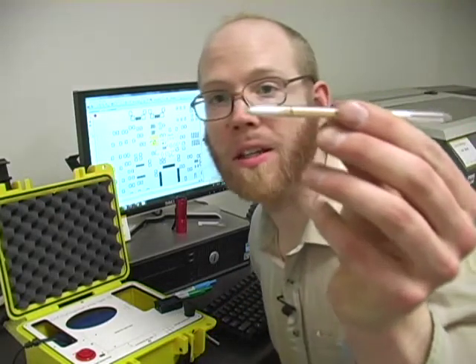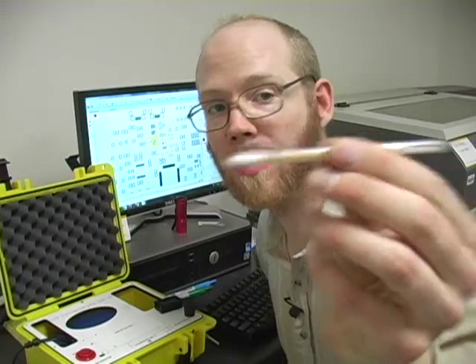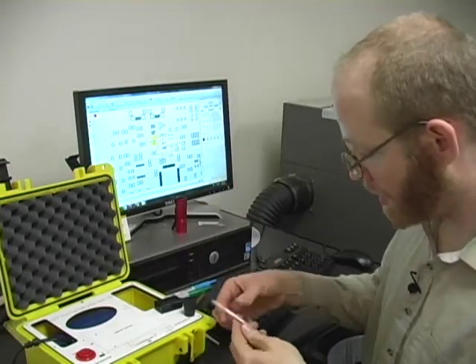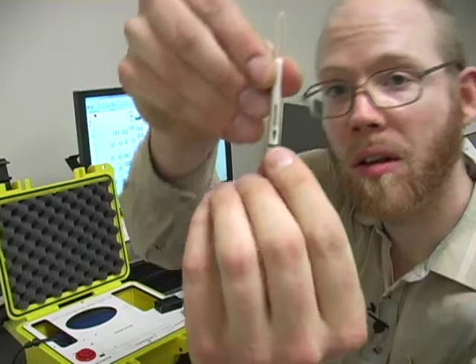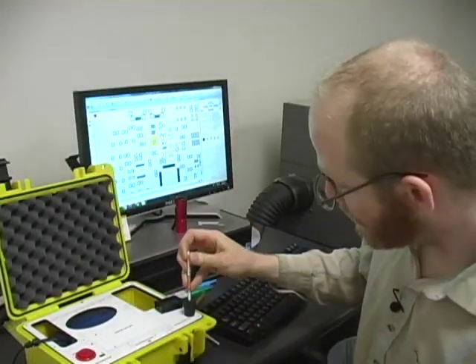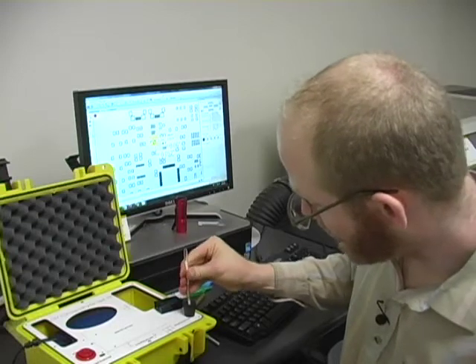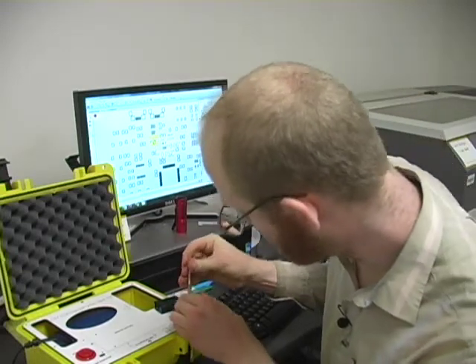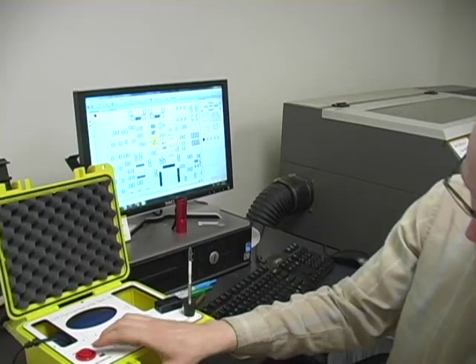Now that the tips are cleanly broken, I'm going to insert it with the arrow headed down into our pump and get things going.